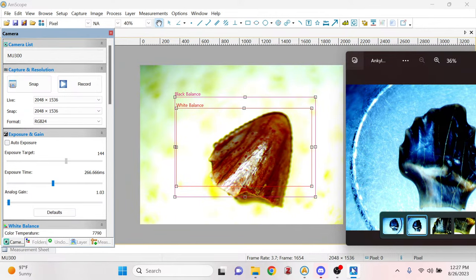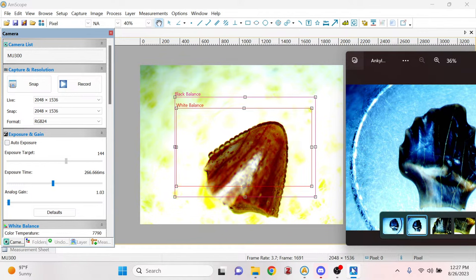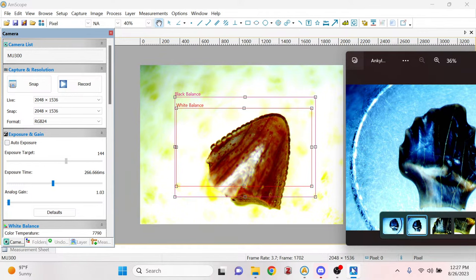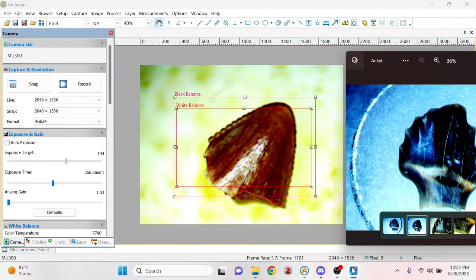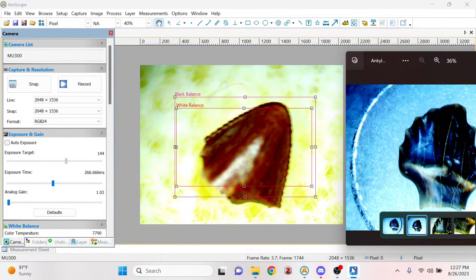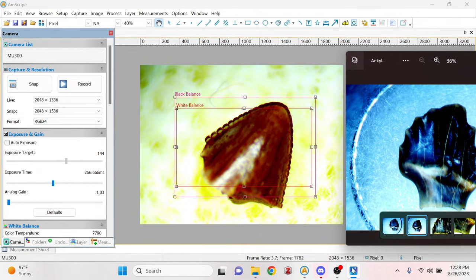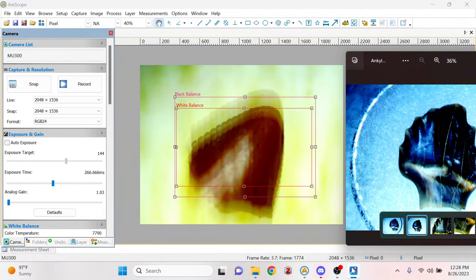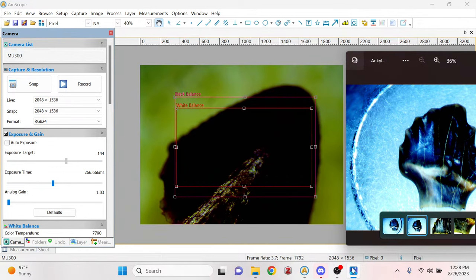So this, for example, I believe is a non-dinosaurian carnivore tooth, a Rivueltosaurus, possibly. I think that species might have been recently amended. Let me put it back where it was. So like right here, you can see grooves on that enamel, those little black lines, and then very good resolution on those denticles. See if we can get closer on those.